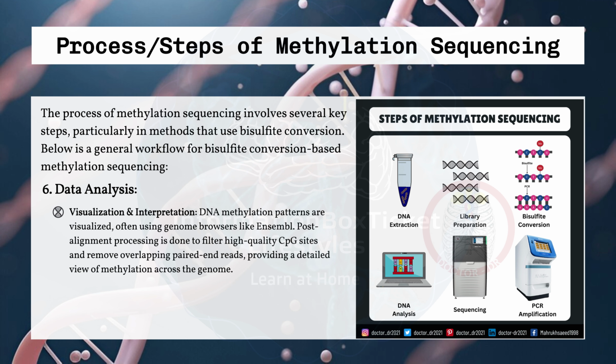Visualization and interpretation. DNA methylation patterns are visualized, often using genome browsers like Ensembl. Post-alignment processing is done to filter high-quality CpG sites and remove overlapping paired-end reads, providing a detailed view of methylation across the genome.